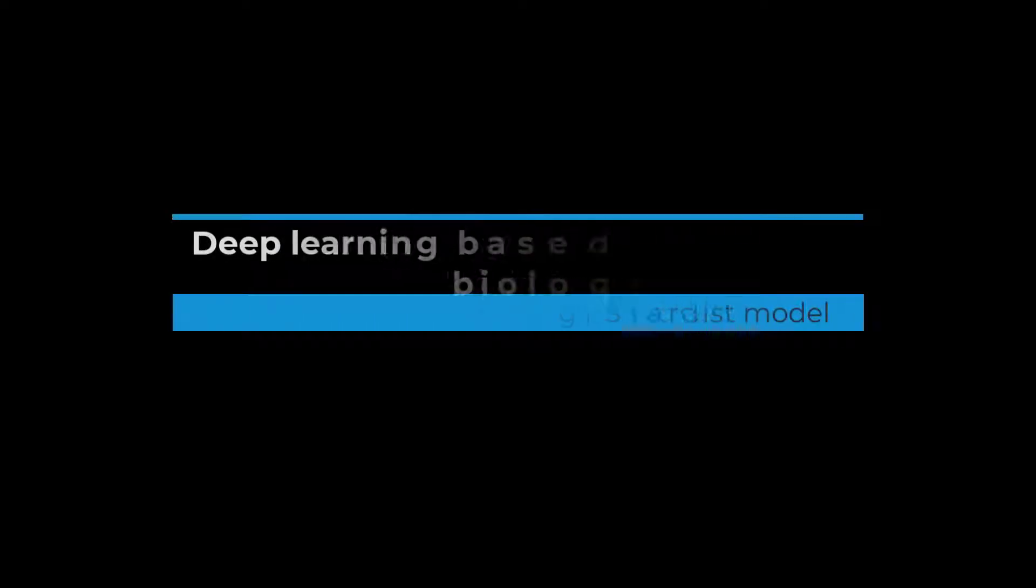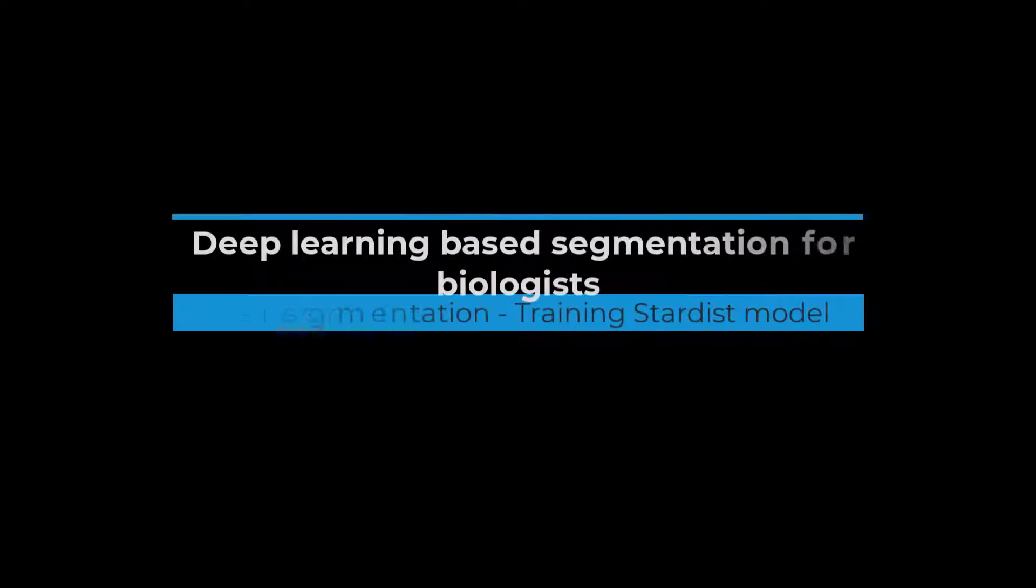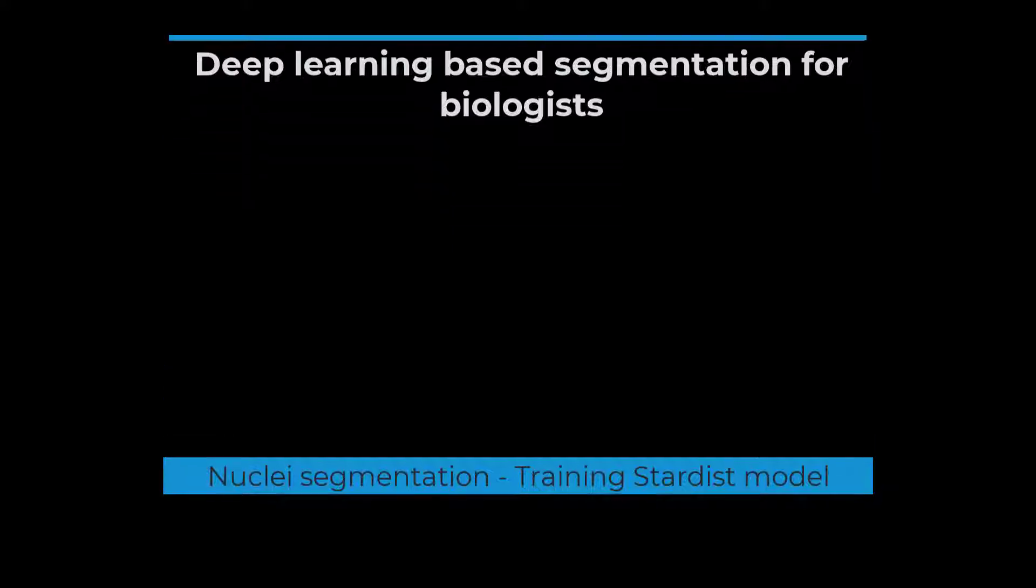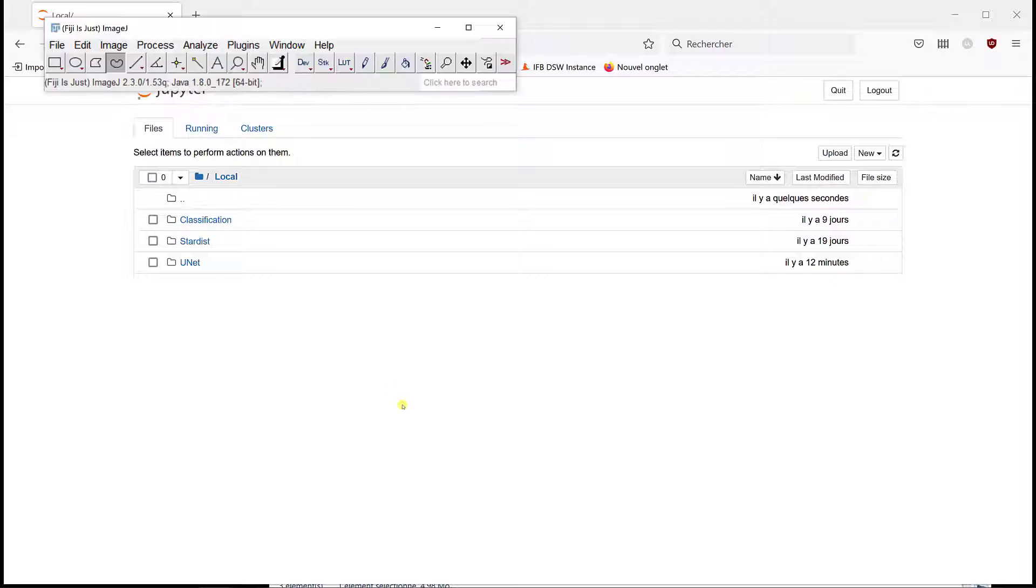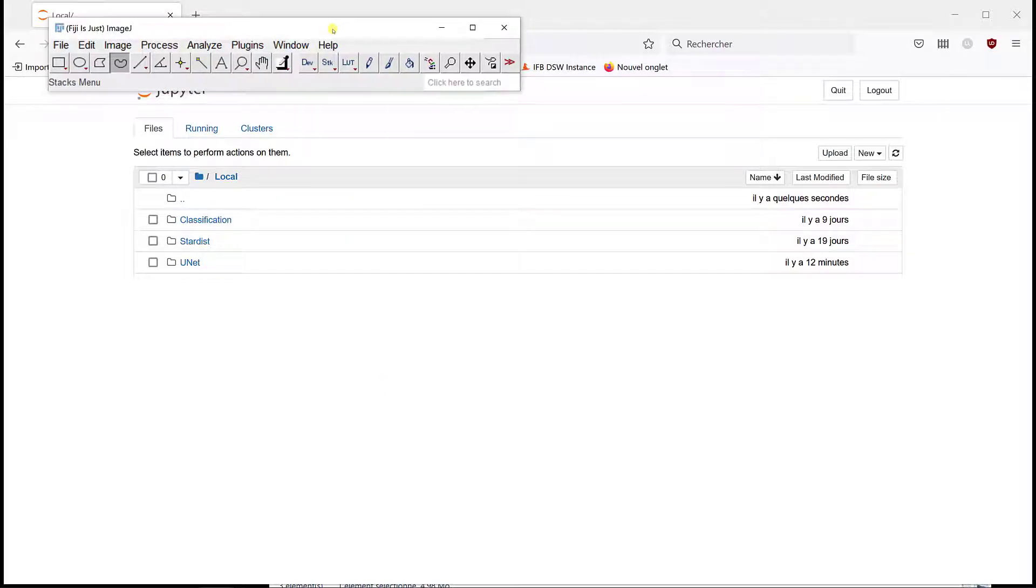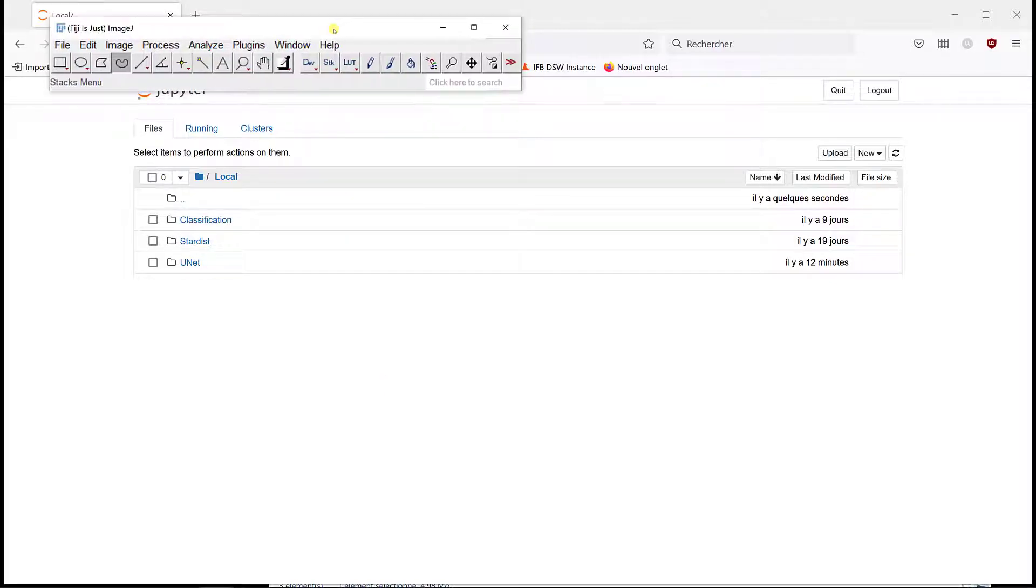In this video, I'm going to show you how you can train a Stardist model for nuclear segmentation. You can install a Stardist plugin that comes with Fiji that comes with pre-trained models.